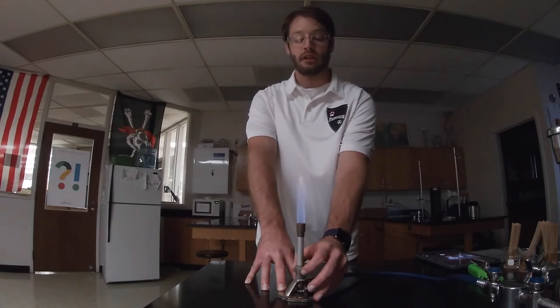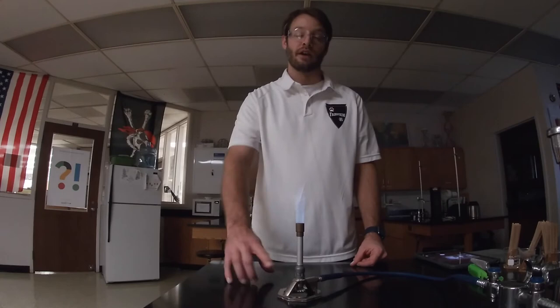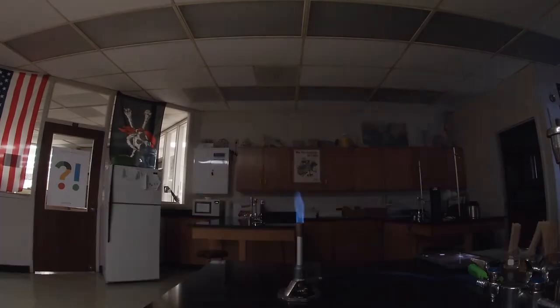As I turn the chimney, you'll see that the flame becomes less orange, less luminous, and more blue. Once I turn it so that it's letting in enough air, we get a blue flame. You'll notice this flame does not have any orange in it. I can also adjust the size of this blue flame by turning the valve on the bottom to adjust the flame size.